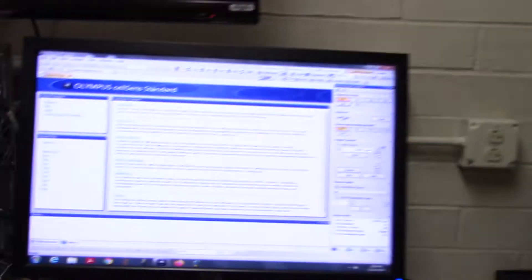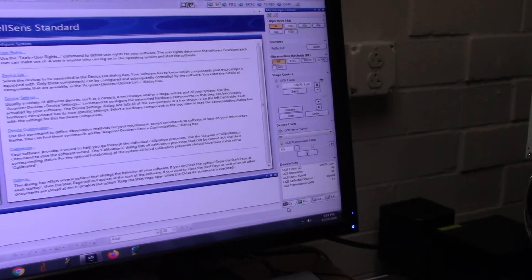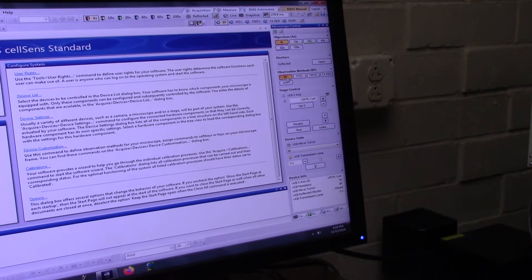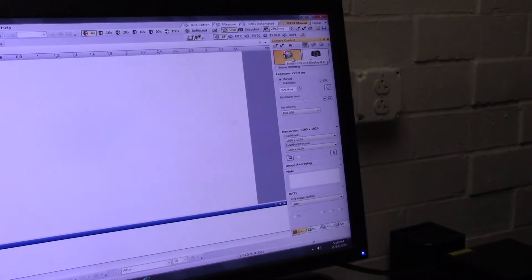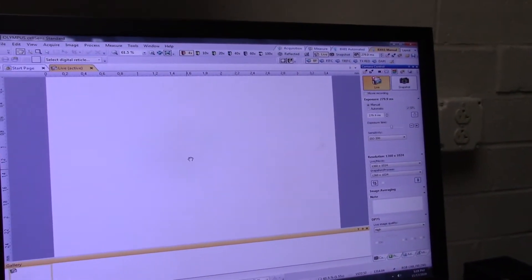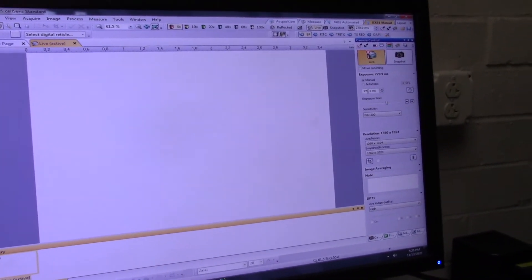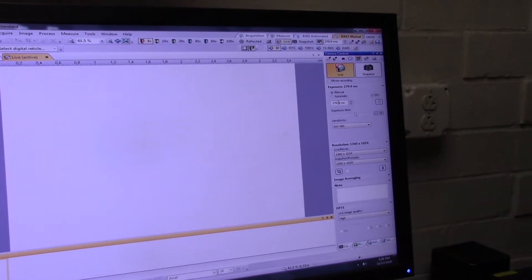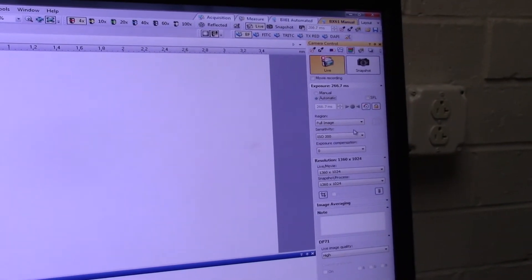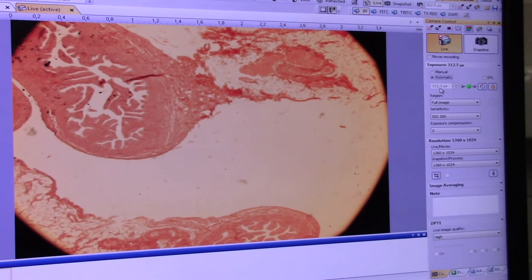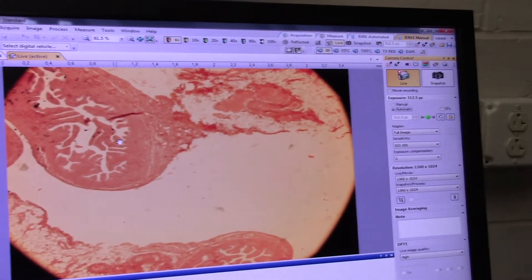Let's see what the camera is seeing. I can go to the camera tab in my microscope control. I've been controlling the microscope to move what light setting is on, what color of light, and what objective lens. Now what we can do is say, show us live what the camera is currently seeing. Right now it's on manual, and it's exposing for 279 milliseconds — for white light, that's an incredibly long exposure, so of course this is overexposed. Let's just hit the automatic button. Now it's at 300 microseconds and we can see our tissue. It automatically adjusted to let the camera absorb light for the right amount of time.